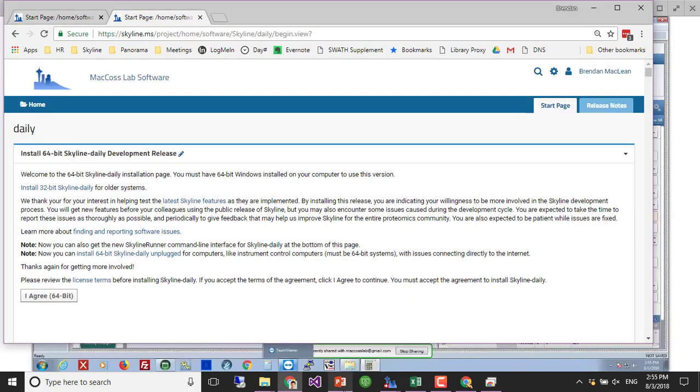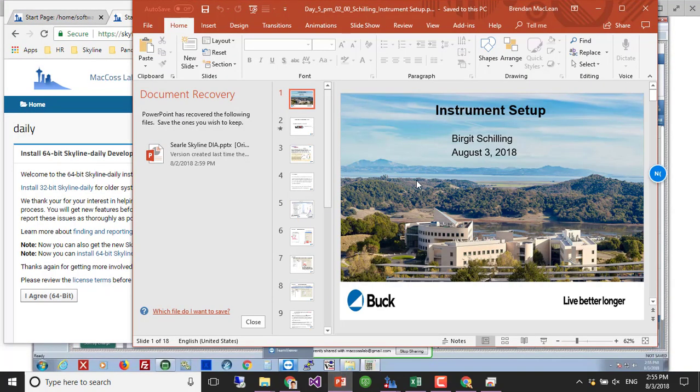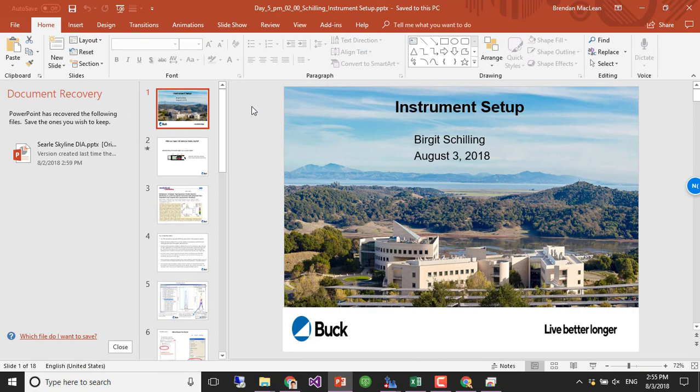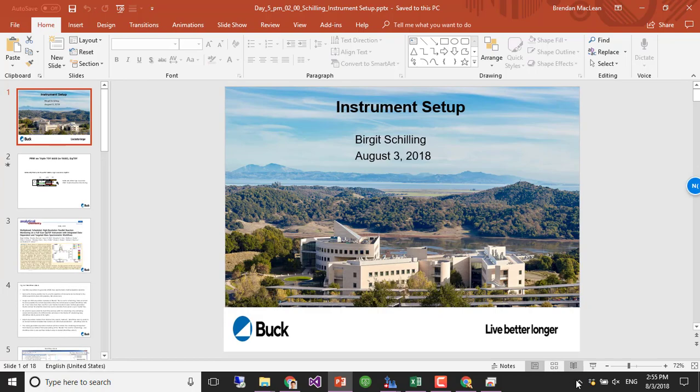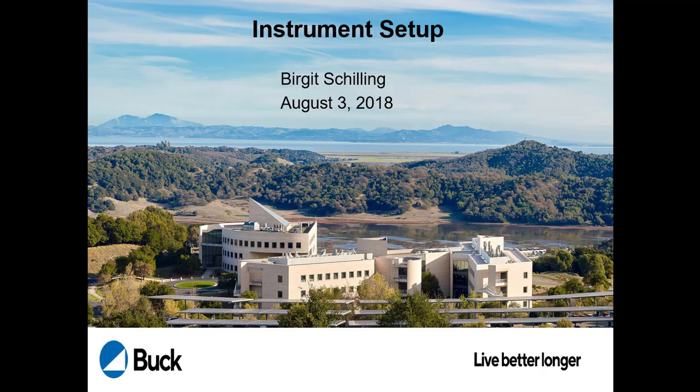Yeah, so it's interesting, you say in your case PRM is very similar to DIA, and that is a little bit different on the SciEx instruments. There, PRM is actually really similar to DDA. Oh, sorry, too many D's and I's. SciEx actually used to call DDA IDA, Information Dependent Acquisition, but I found that extremely confusing now because now we have DIA, right? So anyway, I stick to DIA and DDA.